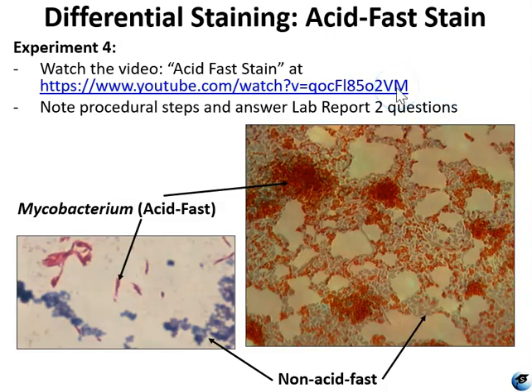You want to be sure that you make notes of all of the procedural steps, any and all equipment that's used, any results that you get, because you're going to need this information in order to answer the guided questions in the report template. And here I've put a couple of examples.